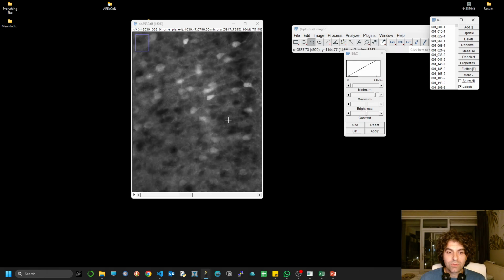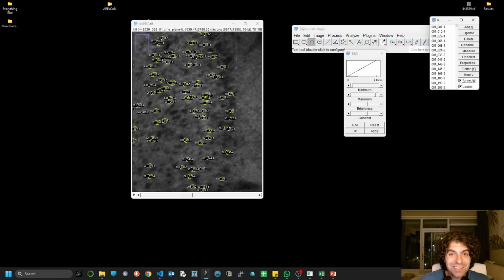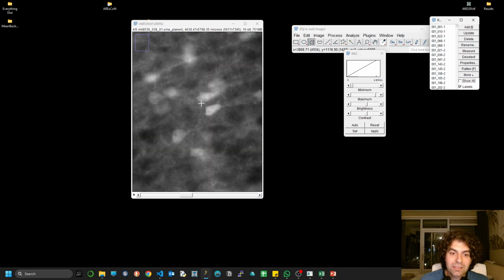I also want to emphasize that if you use StarDist based on this pipeline, I cannot guarantee, I haven't tried it yet, if you can get really good results, or even the Z filtering, because a difference between StarDist and Cellpose is the fact that you never have overlapping observations on the same plane, and that plays a role later on.